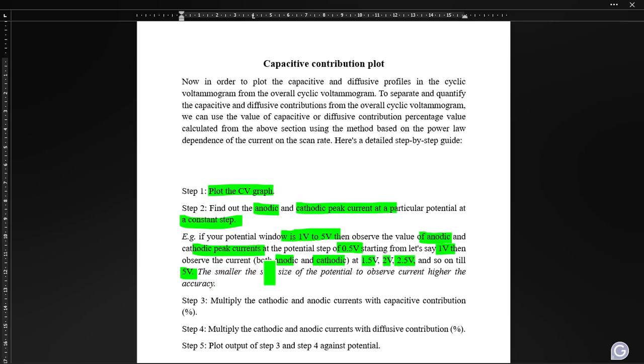Note: the smaller the step size of the potential, the higher the accuracy you get. In this video I am using 0.5 V to save time, but for your own analysis you can take a lower step size like 0.1 V — observe the anodic and cathodic currents, then change the potential by 0.1 V again and repeat.